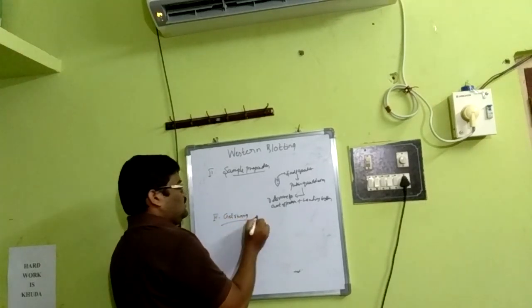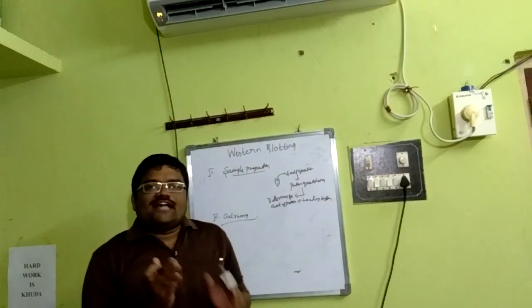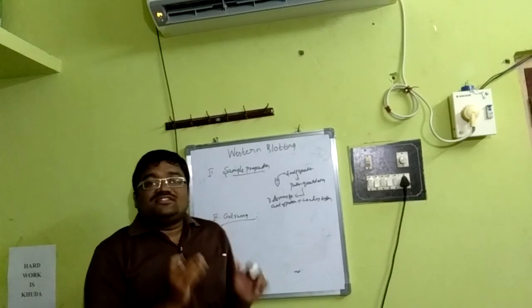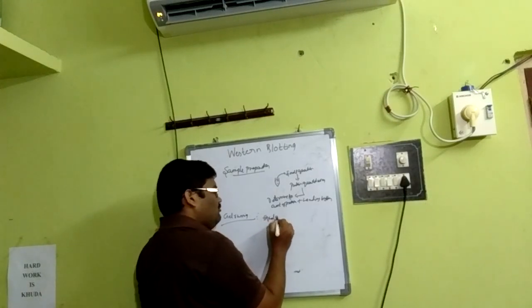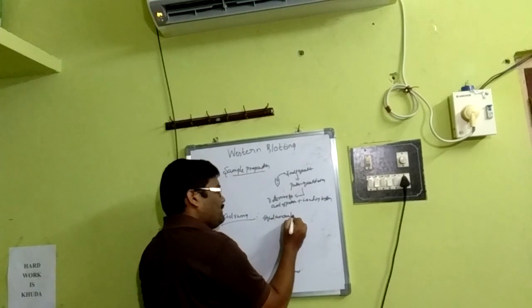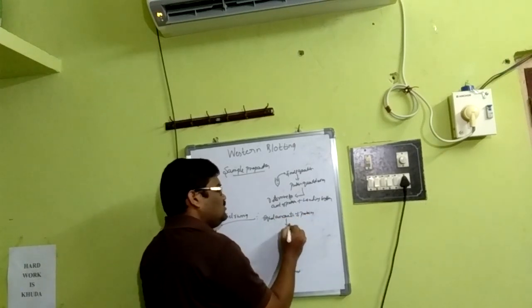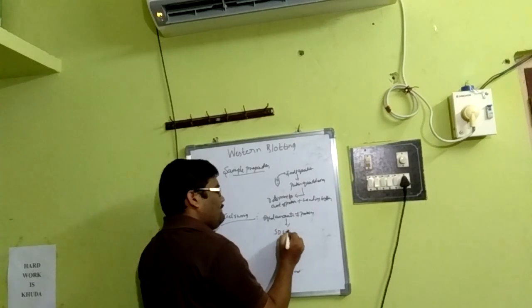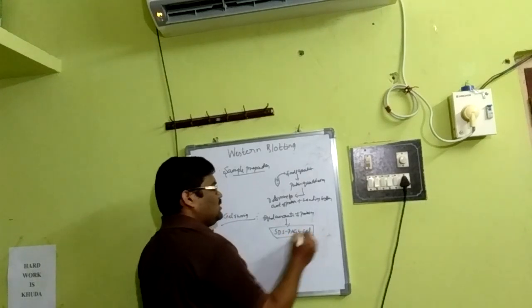How? Equal amounts of proteins have to be loaded onto the SDS-PAGE gels. Equal amounts of proteins subjected to SDS-PAGE gel. This is very important.